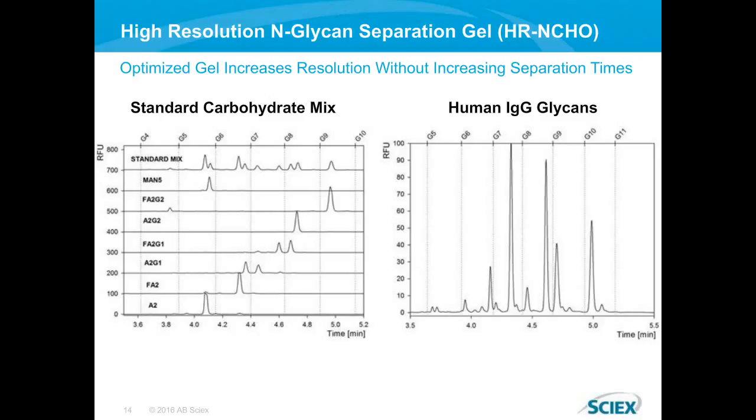So you can see here we've got 2 electropherograms. The one on the left is just your standard carbohydrate mix with all of its constituents down below. And you can see the time frame down there at the bottom. These things are all coming out under 5.5 minutes. So again, very, very quick separations, but still very good resolutions.